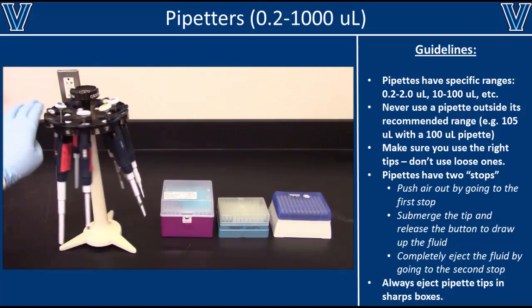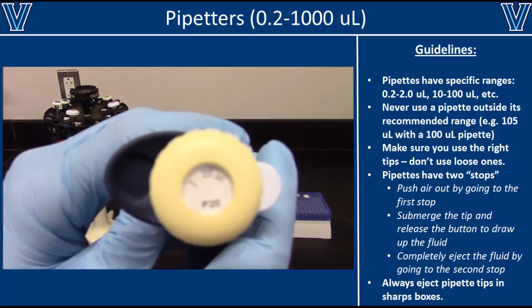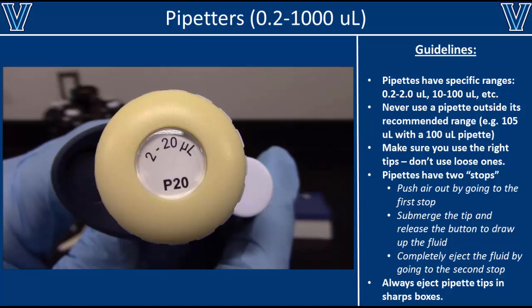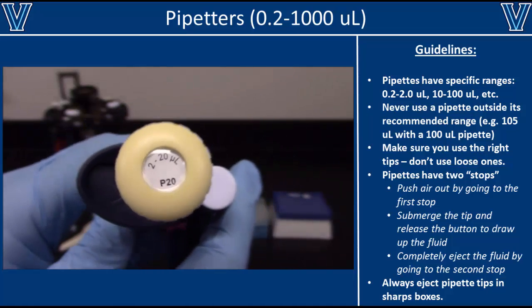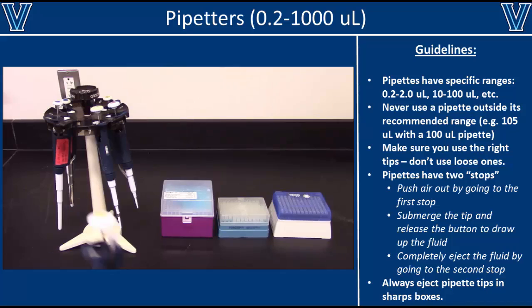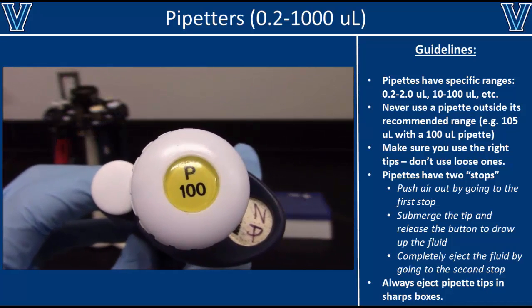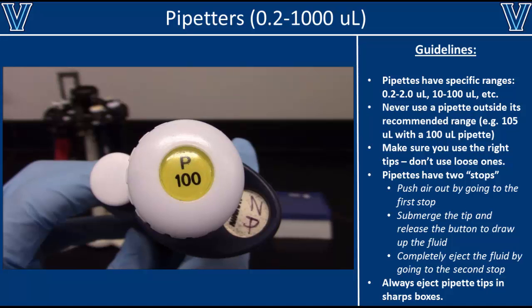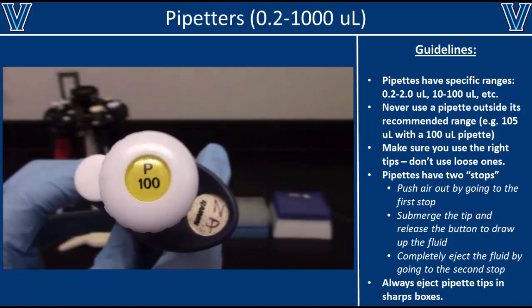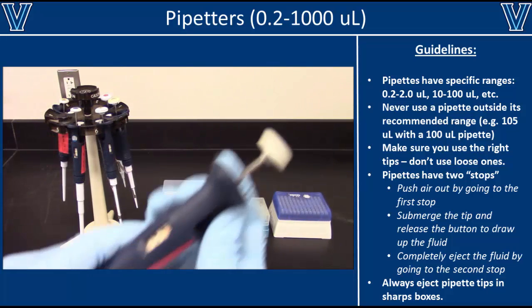Pipettes come in a range of sizes and can accurately transport volumes as small as 0.2 or as large as 1,000 microliters. The volume range of each pipette is shown on top of its plunger. For example, this P20 pipette can transfer 2 to 20 microliters. Sometimes only the maximum volume is shown on the plunger, but the volume range of all pipettes is tenfold, so this pipette transfers 10 to 100 microliters.